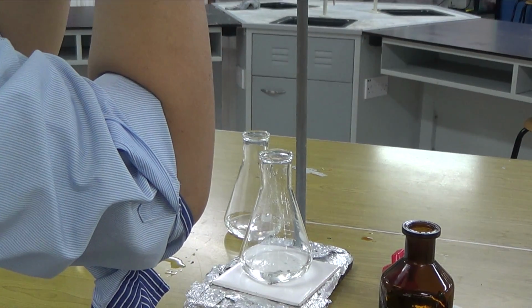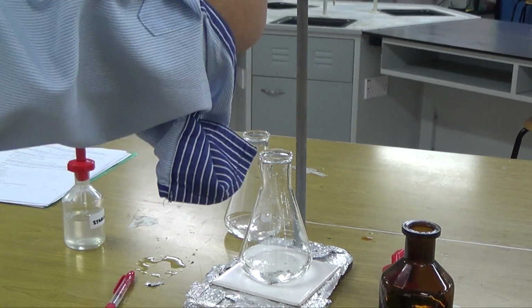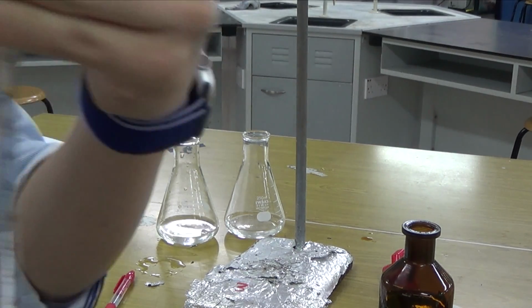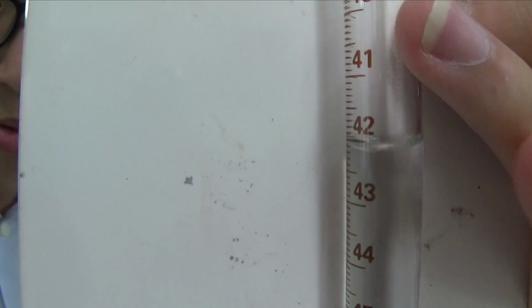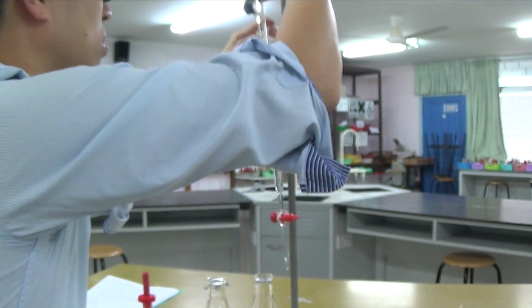Is it 41.0? Sorry, no, not 41, 42.0, okay? Am I correct, 42.0? Give or take, actually that's 42.1 to be honest, 42.1. Oops, let me just zoom that out. I have lost a bit of accuracy, so that's 41, that's 42. So that should be 42.1. You might read it as 42.2, but I read it as 42.1 cm cubed just now. So that was 42.1 cm cubed.